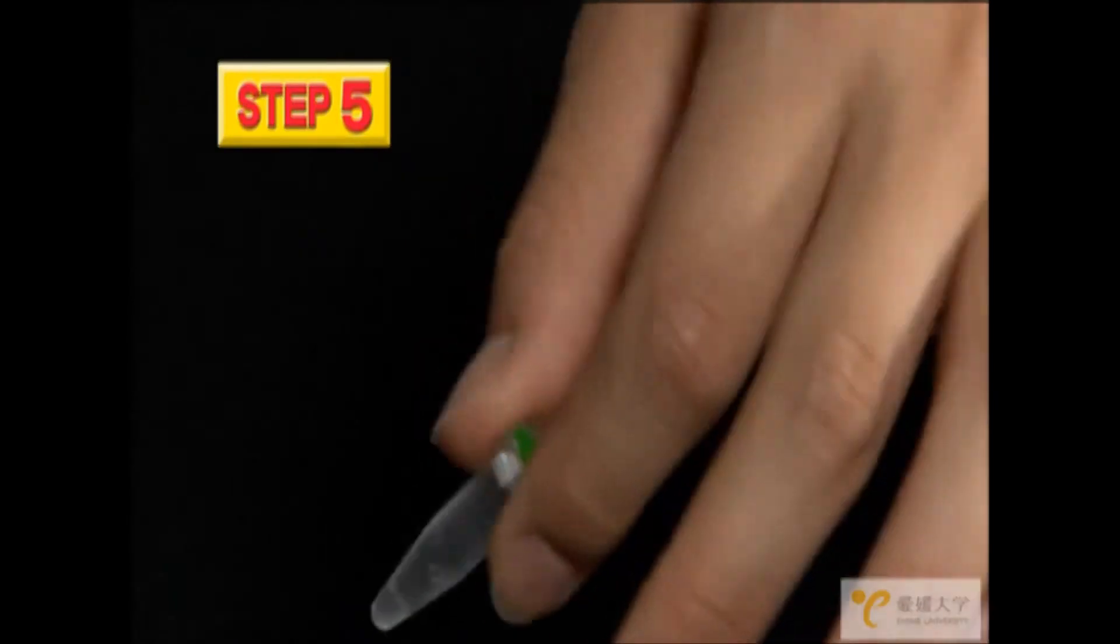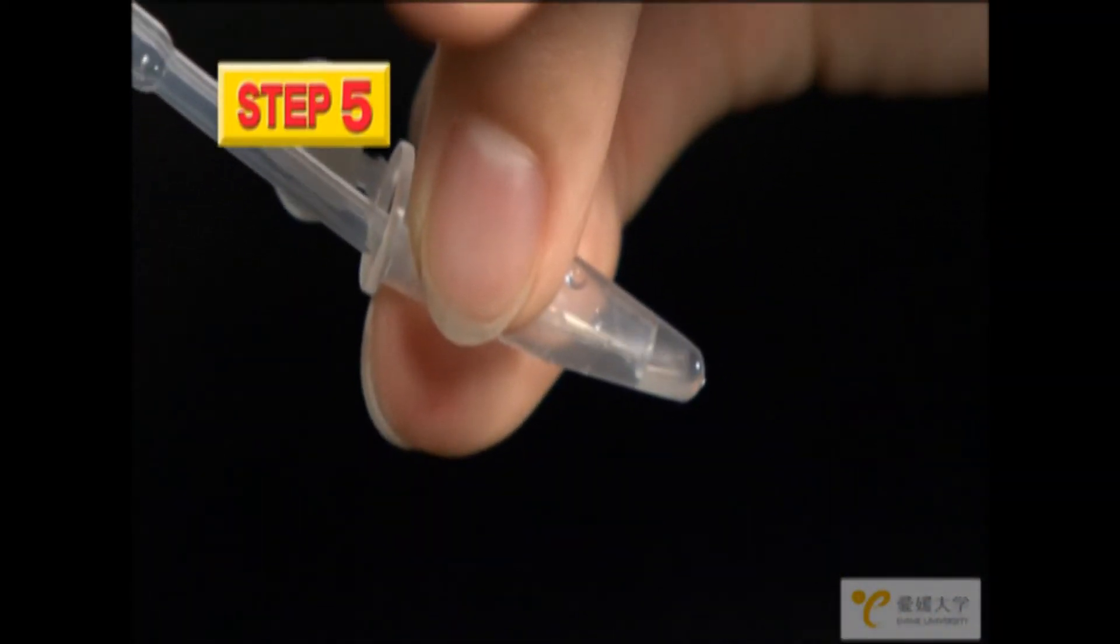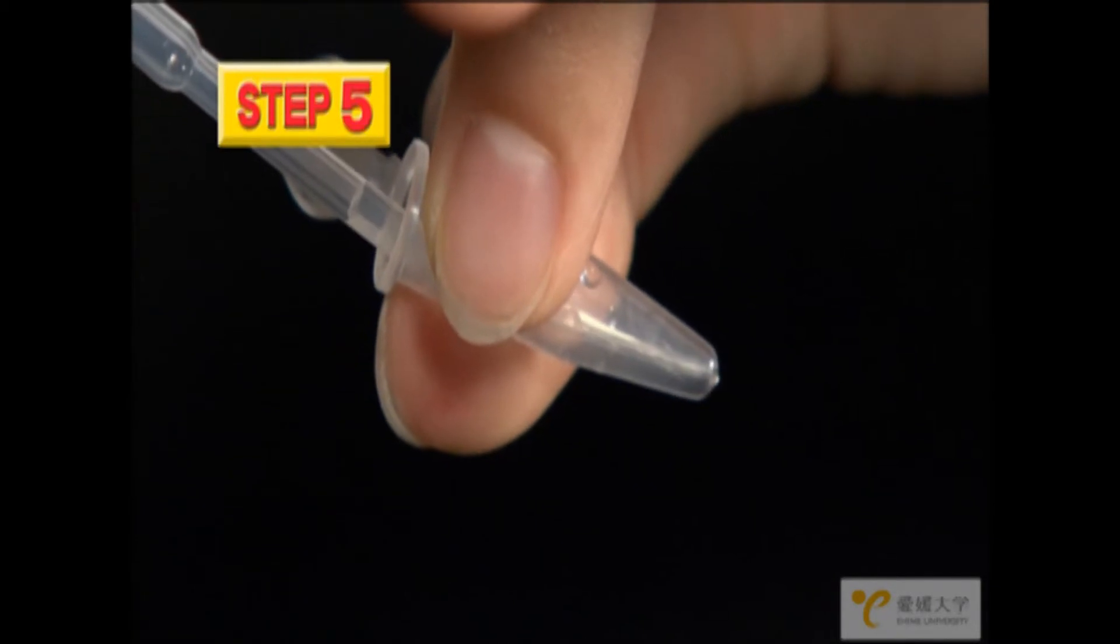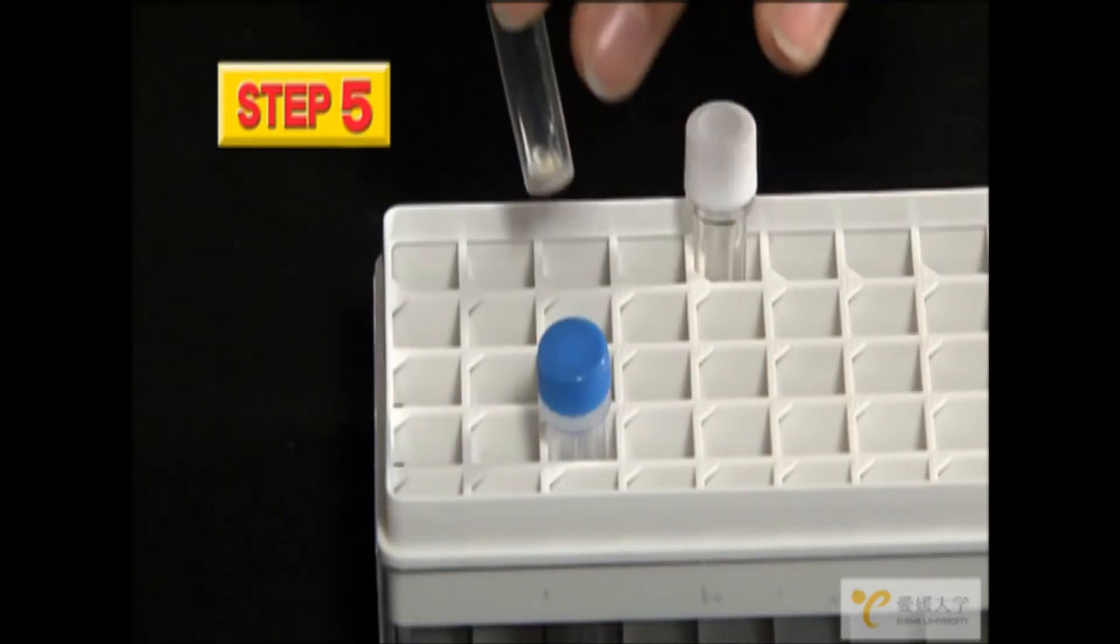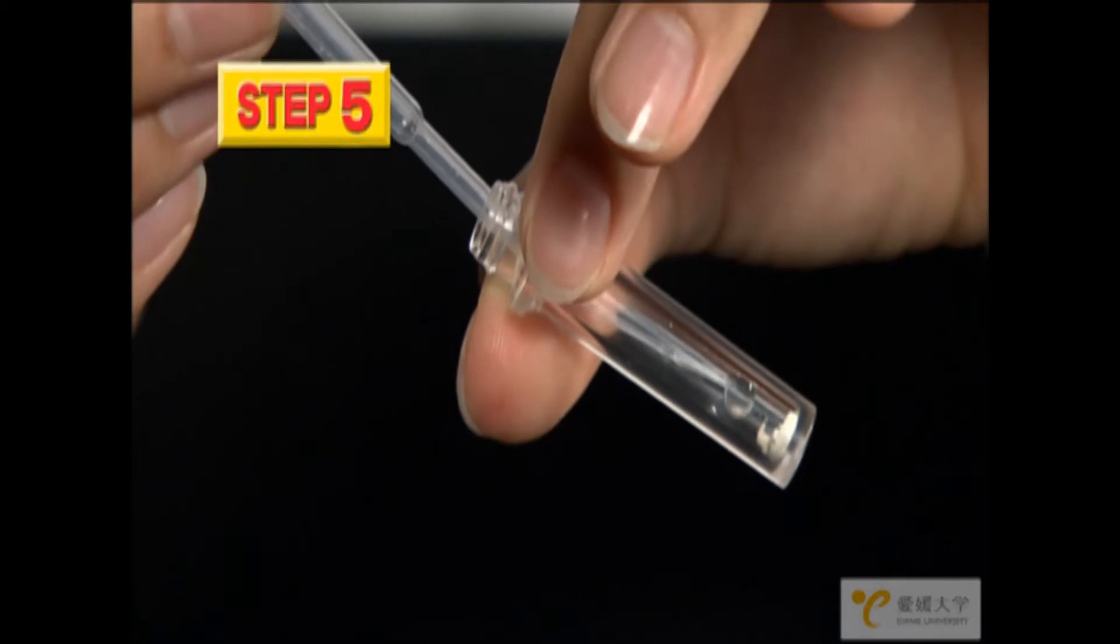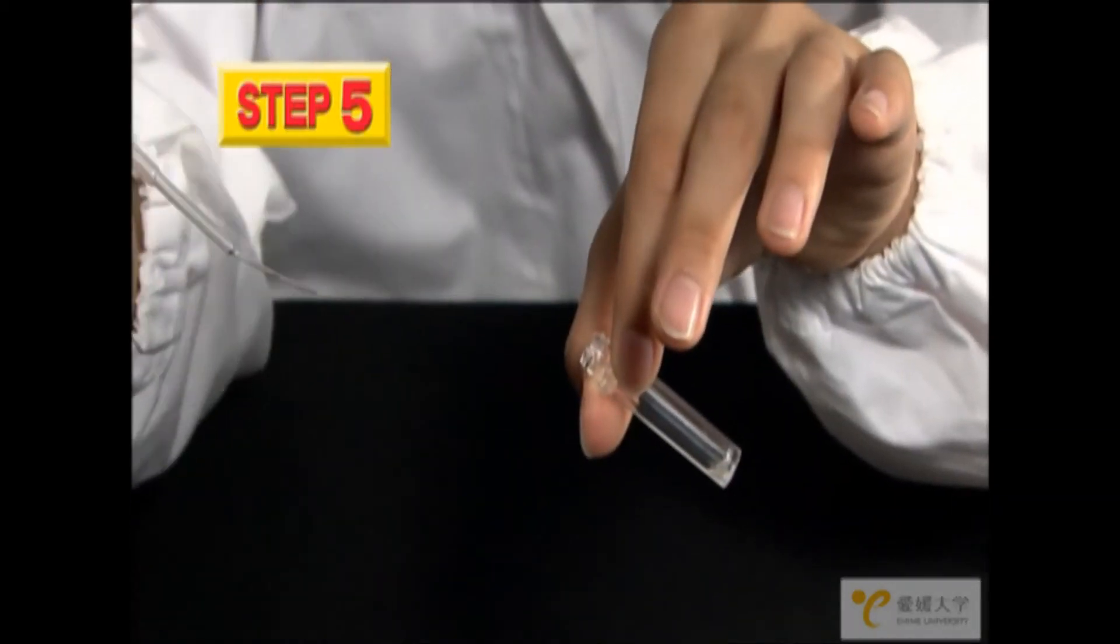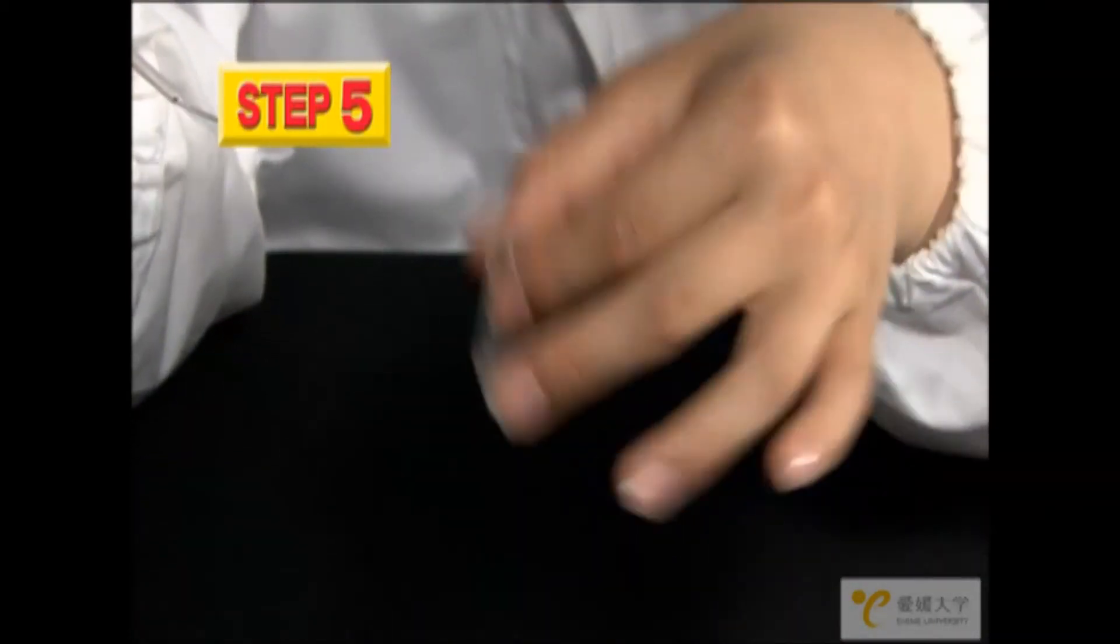Then, make sure the liquid has settled in the bottom of the small tube with the green dot. Remove the cap and use the dropper to collect the liquid. Expel the liquid in the dropper into the large tube. Shake the tube until the powder dissolves, making a white solution.